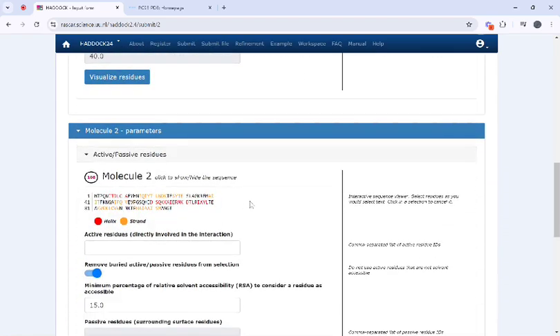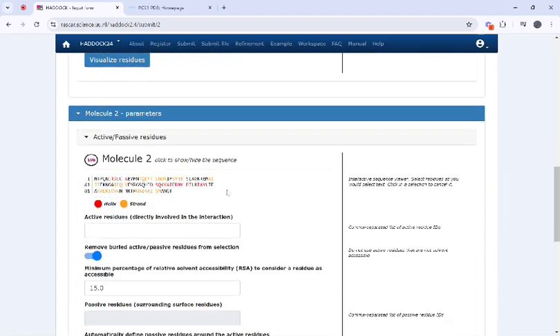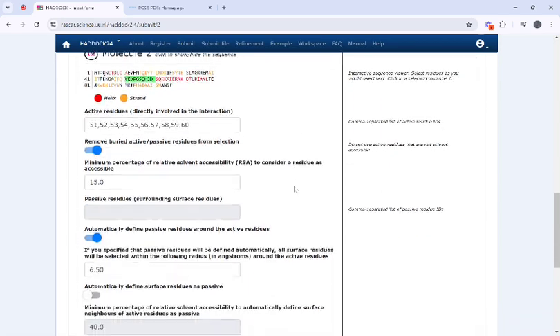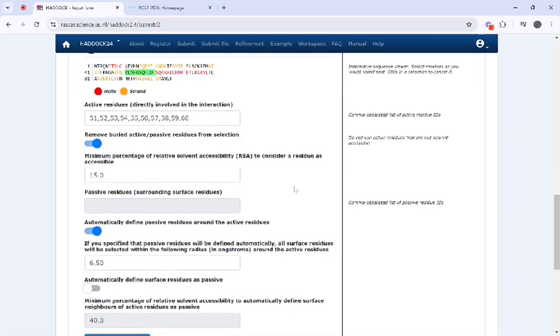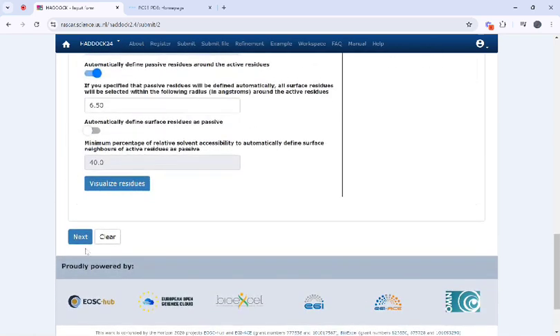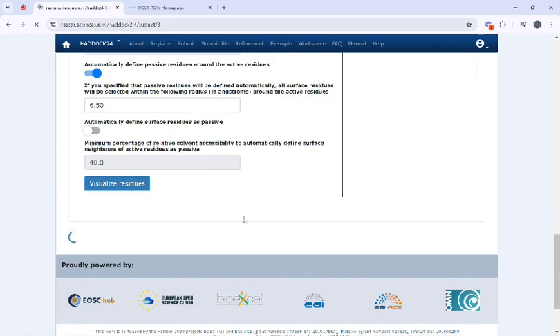Here I will select for example these residues as active residues, then just click on next.